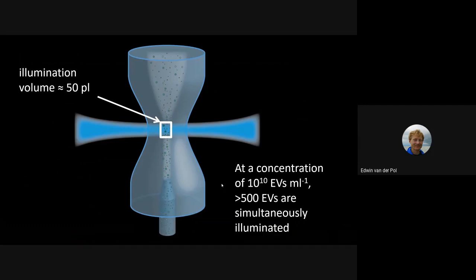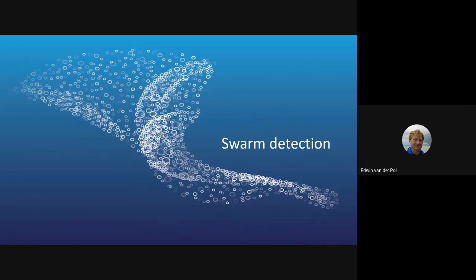We looked at the configuration of the flow cytometer: the focused laser beam, the sample stream carrying the particles, and the effective illumination volume, which we calculated and estimated based on the geometry to be around 50 picoliters. From other equipment and flow cytometry, we knew that the concentration of vesicles in this urine sample was around 10 billion EVs per milliliter. That means that without dilution, on average more than 500 vesicles were simultaneously illuminated — and we were not aware of that at that time. We gave this phenomenon the name swarm detection.